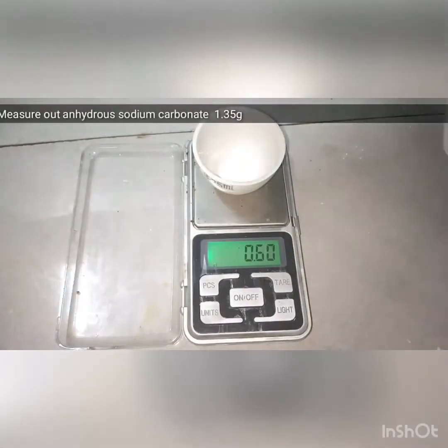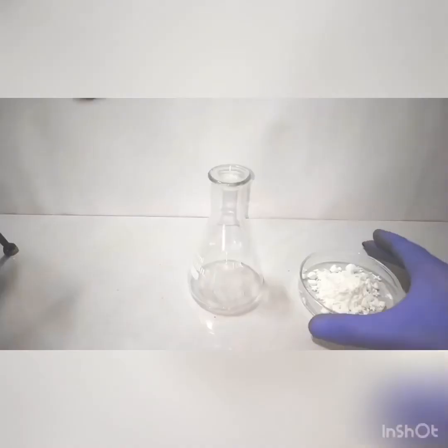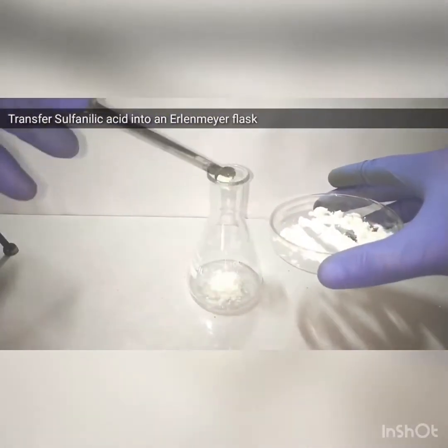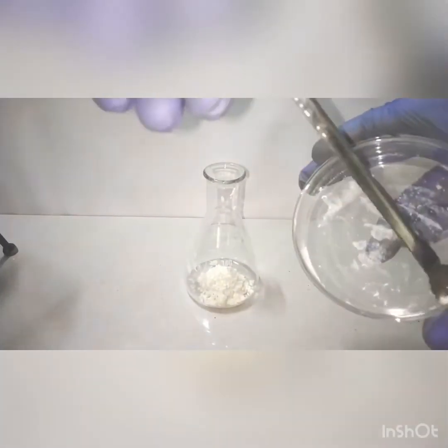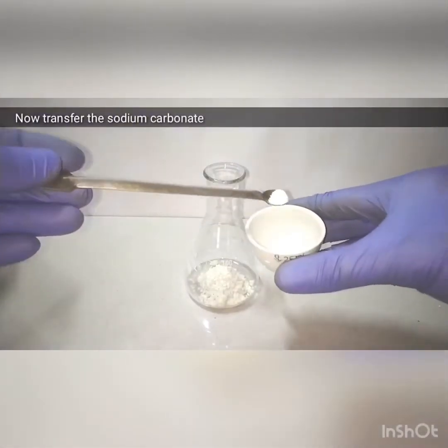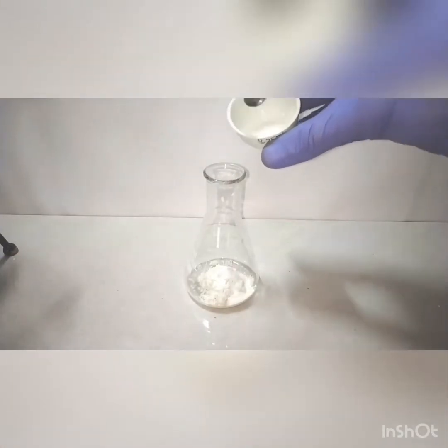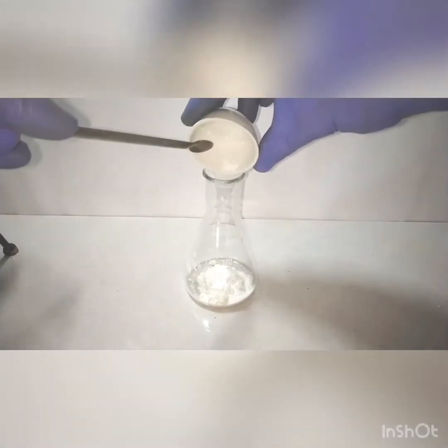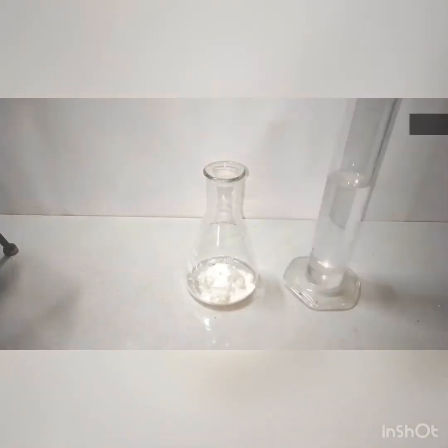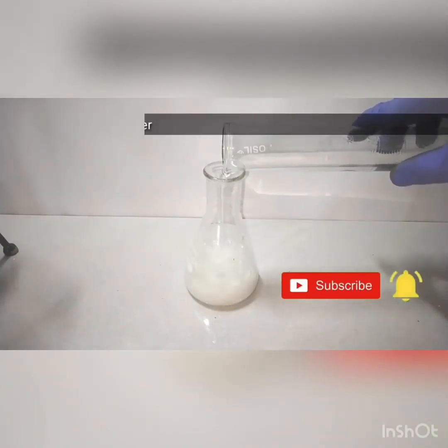Next we measure out 1.35 grams of anhydrous sodium carbonate — sodium carbonate is available as soda ash or washing soda. Now we transfer the measured sulfanilic acid into a 100 ml Erlenmeyer flask, and on top of that we add the anhydrous sodium carbonate. Into that we add 50 ml of distilled water to start the reaction.